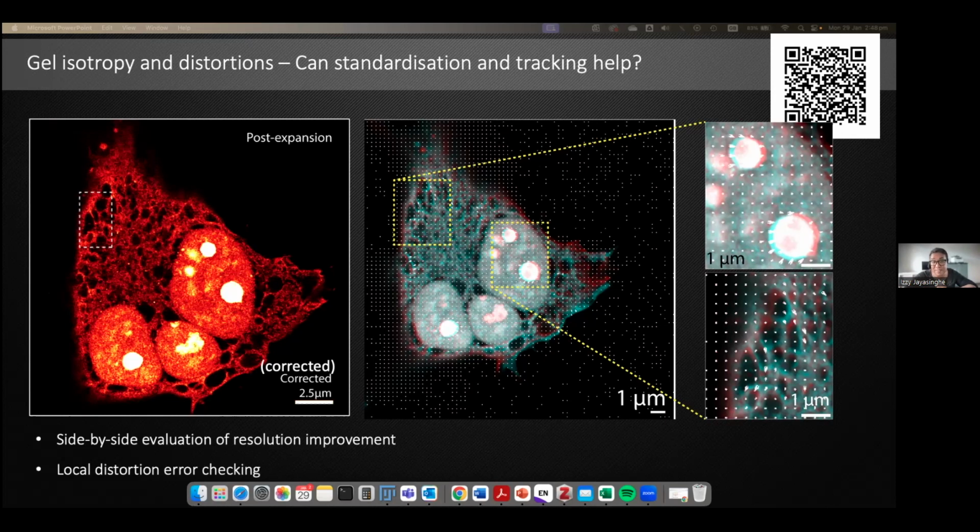And that's just comparing different samples with one technique. We have found through our experience of imaging muscle tissue, which becomes relevant especially if you want to study human hearts, that 4 times expansion is about as far as we would go, because 10 times expansion involves too many distortions, and often you have to do an extensive readjustment of the recipe to make it work, especially when there's extracellular matrix involved. So I hope I have answered the question.